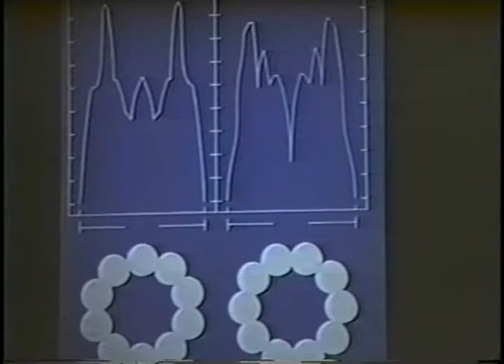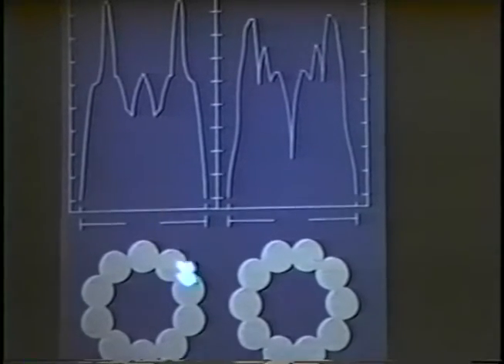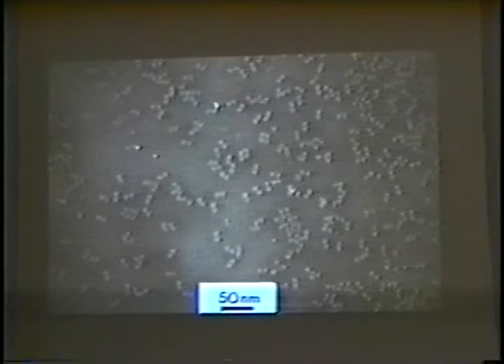The reason for this doublet image is derived directly from our molecular model. The thickness of protein in a vertical direction represents a peak of electron transmission. The summated thickness of protein across the molecule gives us this curve. Slightly different here because of the orientation of the bead-like molecule. But in both cases, two peaks of electron transmission, which in the electron optical image give us a doublet. Some electron microscopical images of the enzyme alpha-mannosidase from jack bean.